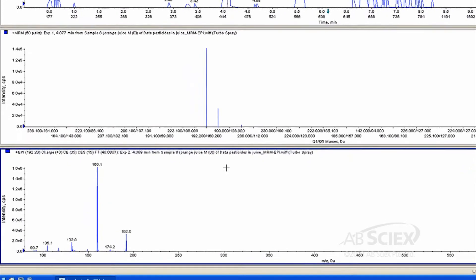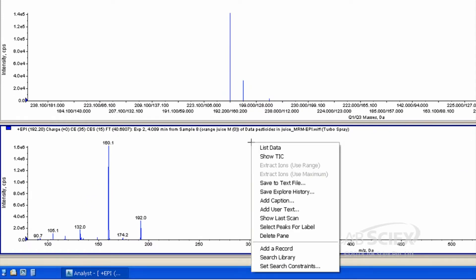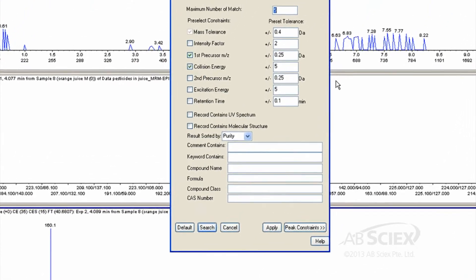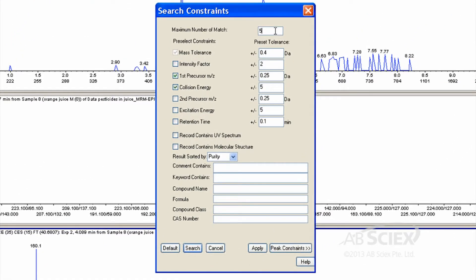Step 4: Set up your library search constraints by right-clicking on the EPI Spectrum pane and selecting Set Search Constraints. We suggest setting the mass tolerance to 0.4, the first precursor mass to charge to 0.25 Daltons, and the collision energy to 5. You will also want to sort your results by purity score. Click Apply, then click Search.